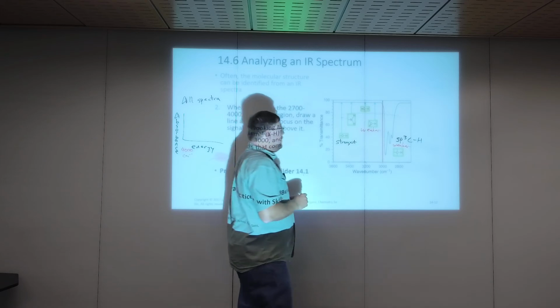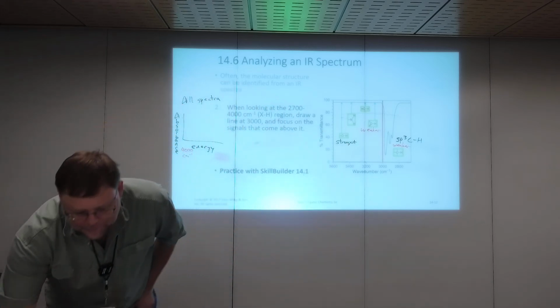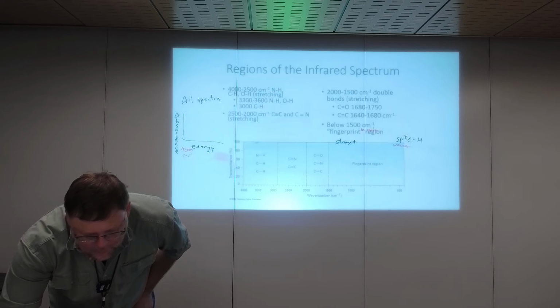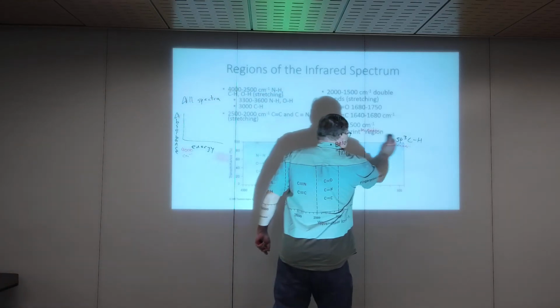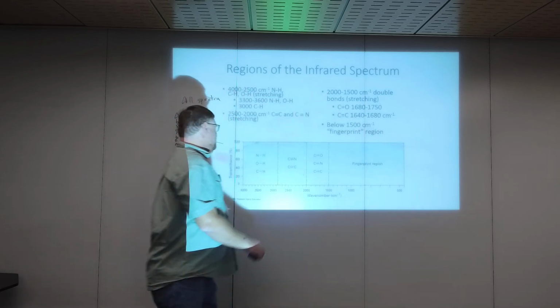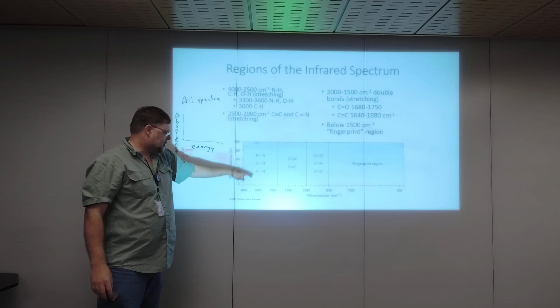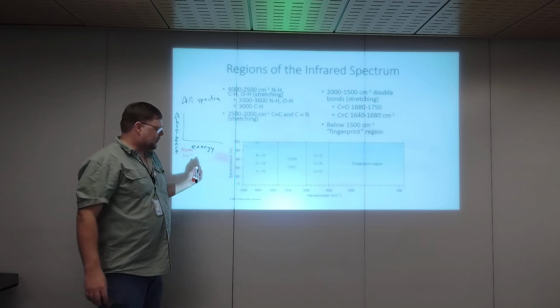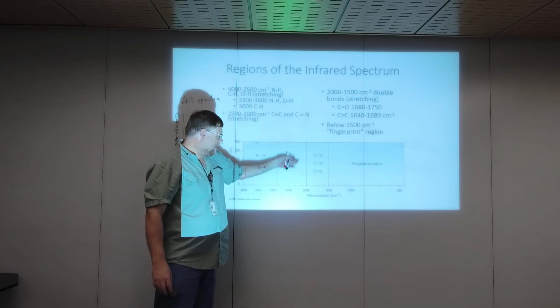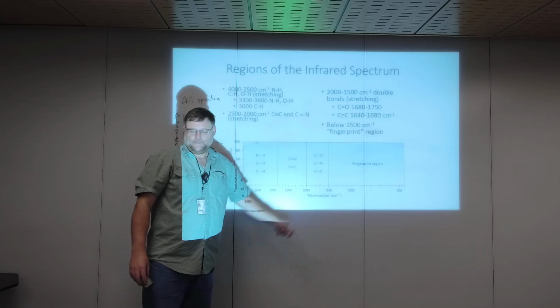So very often you might see this, well, let's actually look at some spectra. How about that? All right, so again, just putting up this thing you need to know. I'm going to keep harping on this. NH, OH, CH, 2700 to 4000, down on the higher frequency end of the spectrum, triple bonds, double bonds, fingerprint region that you can ignore.